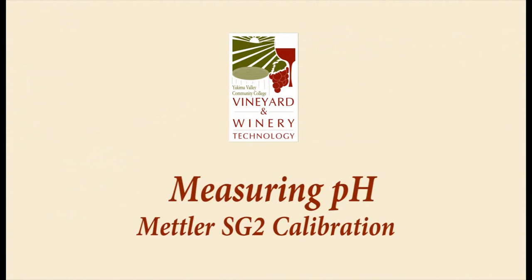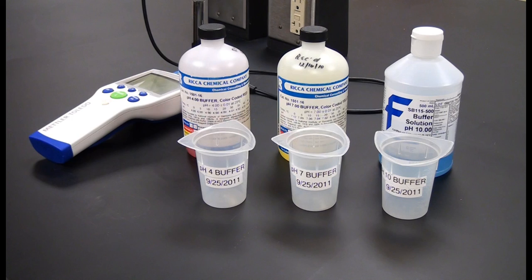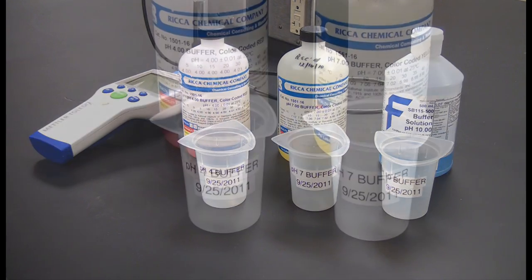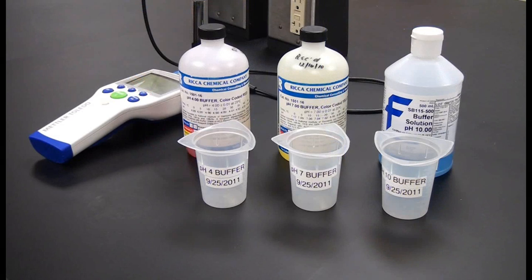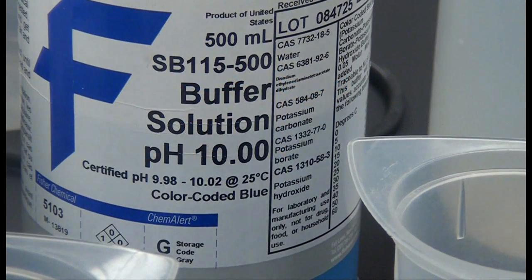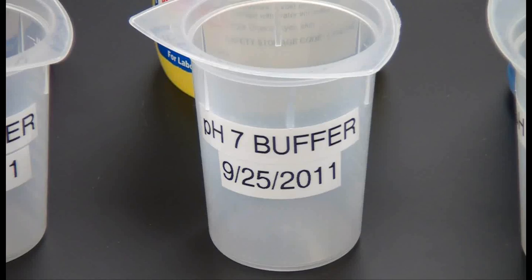To calibrate the meter, obtain 2 or 3 pH buffer standards. When performing a 2-buffer calibration, it should be buffer solutions of pH 4 and of pH 7. A 3-buffer calibration will also use a pH 10 buffer. Any solutions dispensed into another container should be clearly marked and dated for the date dispensed.